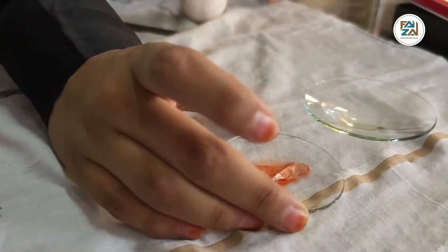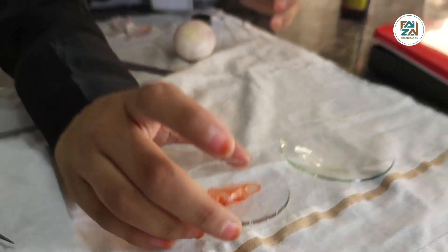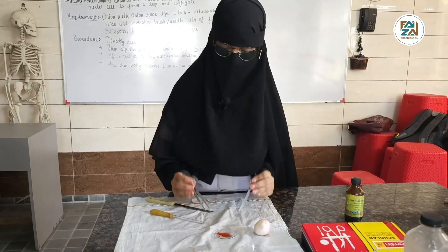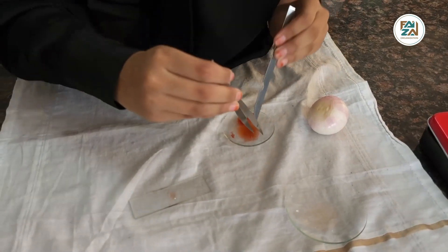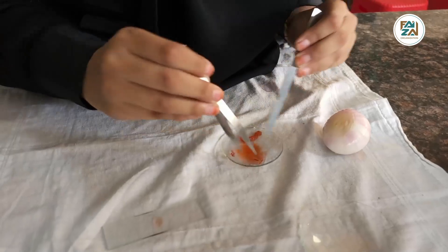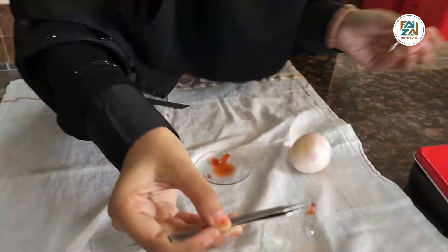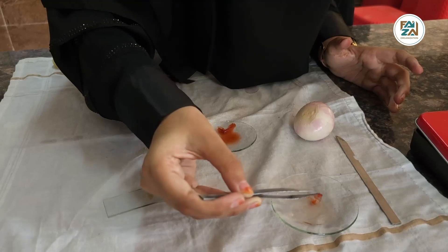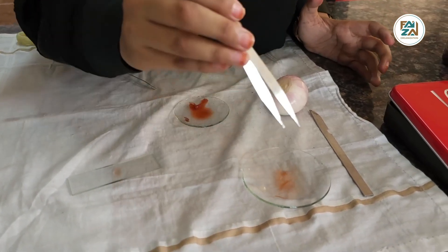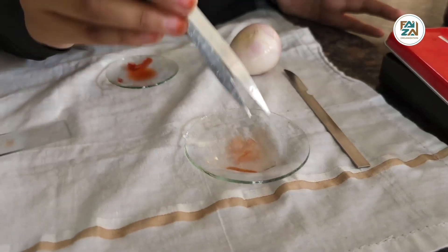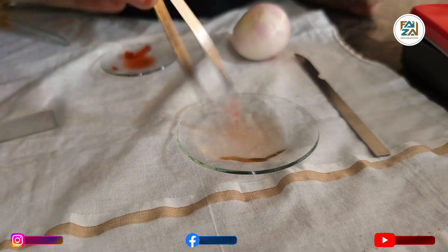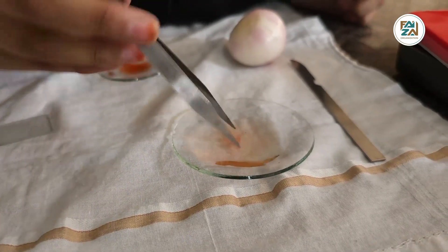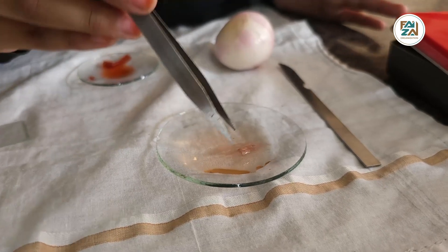Now it will be heated, or we can also put it in sunlight. Five minutes is over. I have to take a little piece of this onion peel — for more precise measurement I will take a piece of approximately 0.5 cm. Let's pour it into water so that any extra stain is removed. Whatever extra stain was present is not present anymore because I washed it.